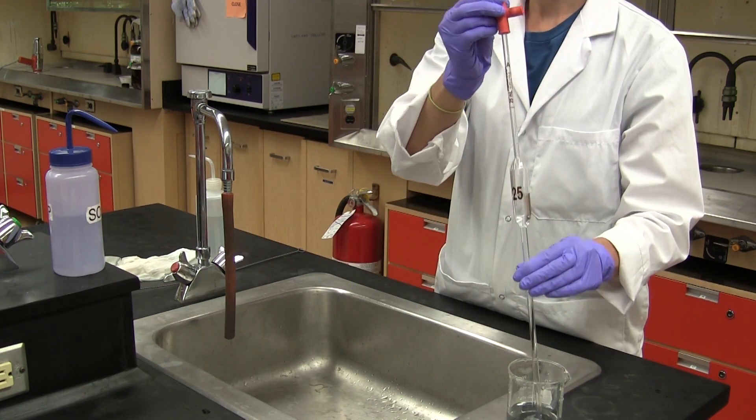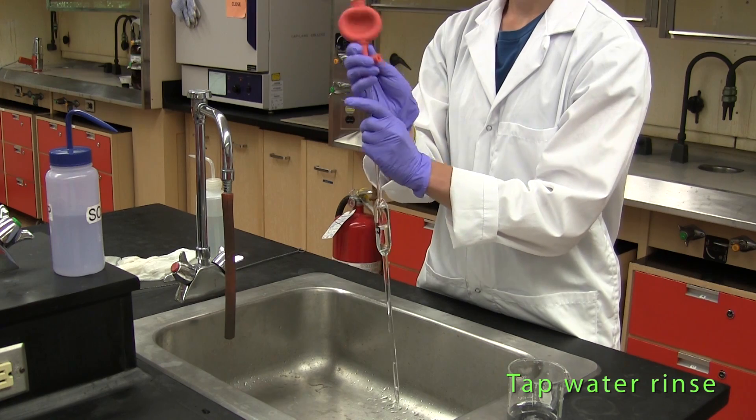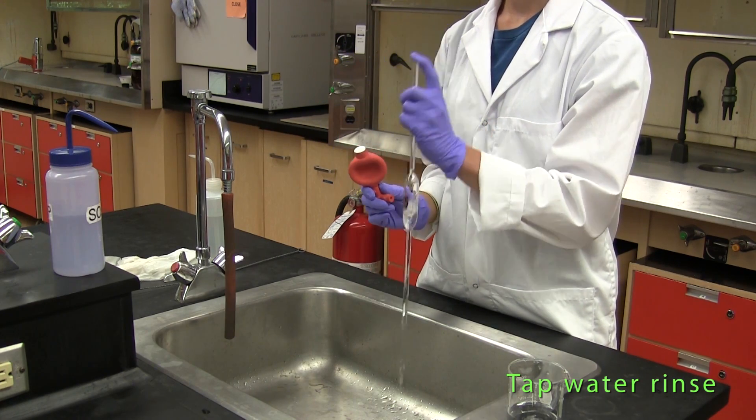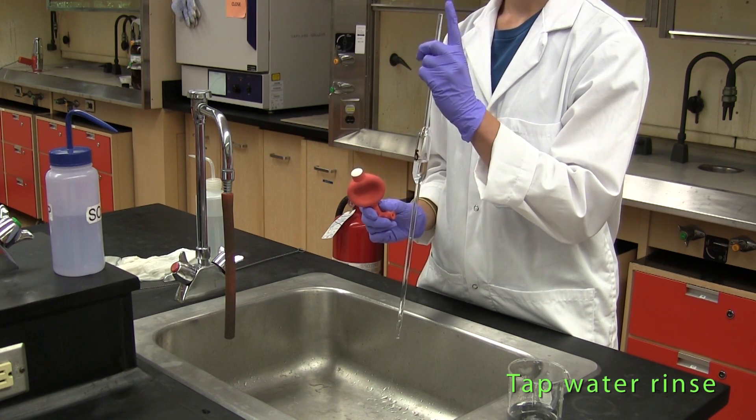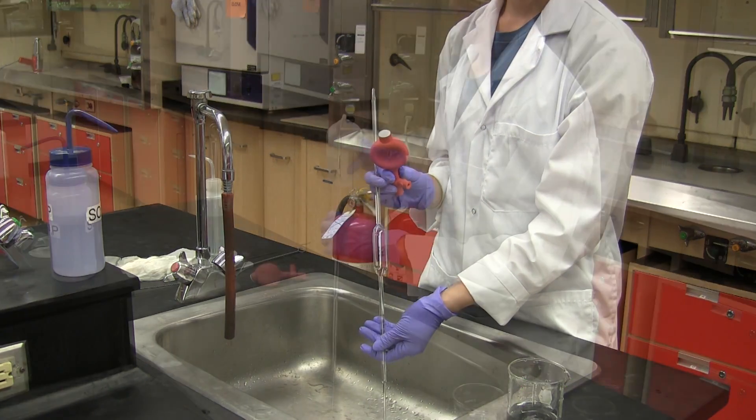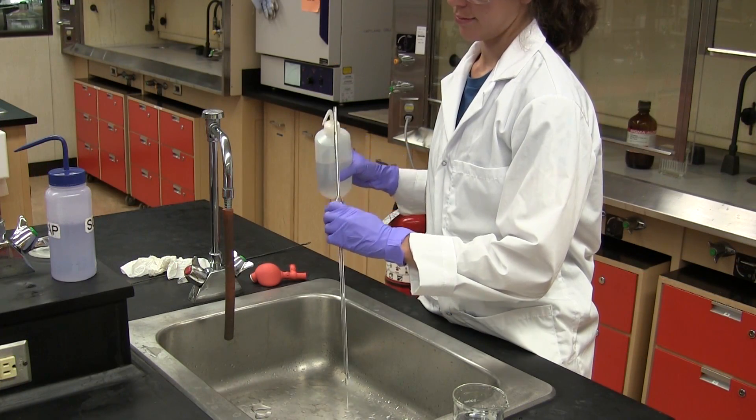The pipette is then rinsed two to three times with tap water until the detergent is completely flushed away. Finally the pipette is rinsed several times with distilled water.